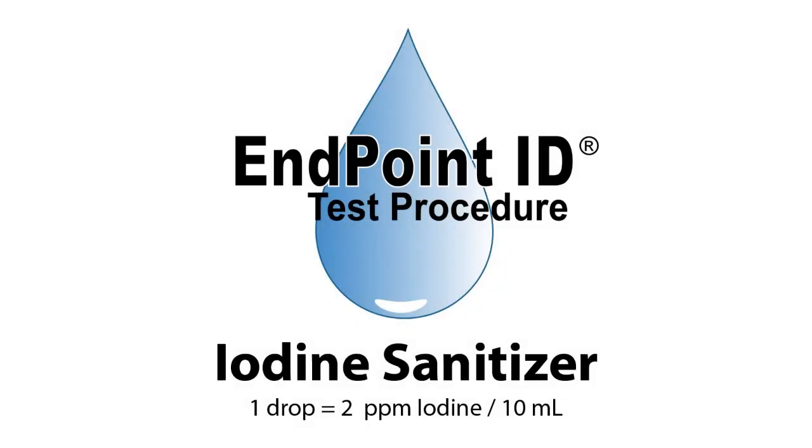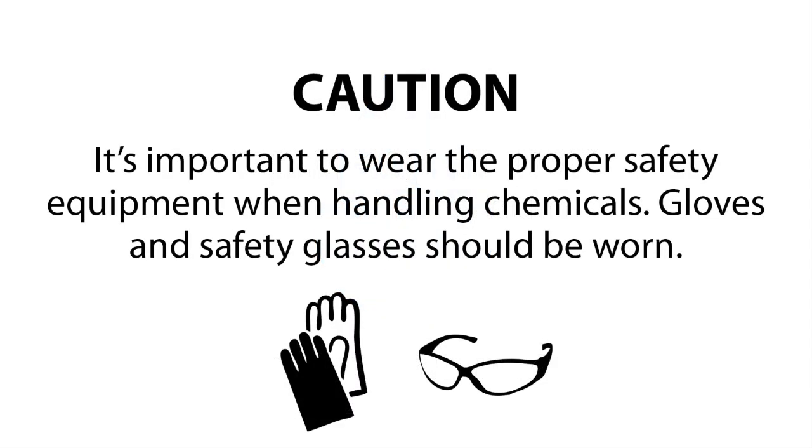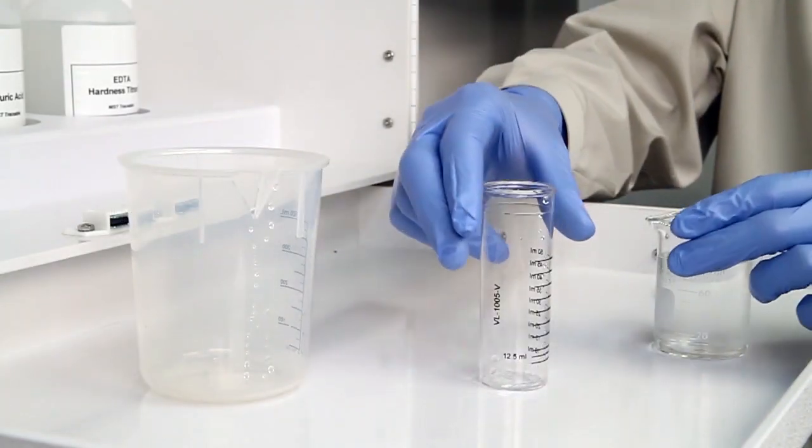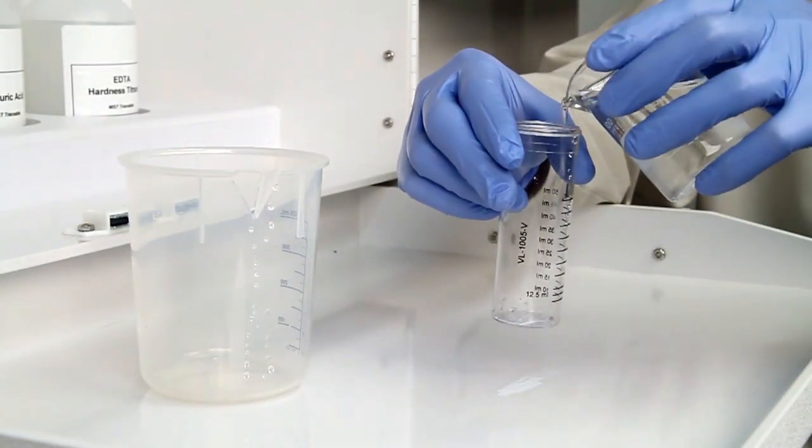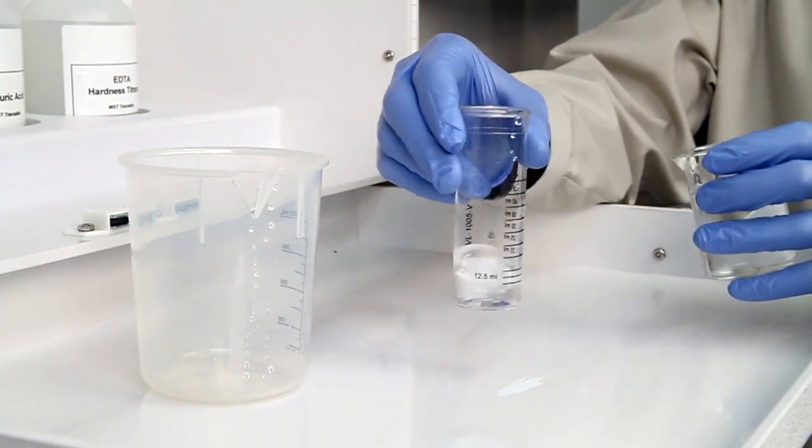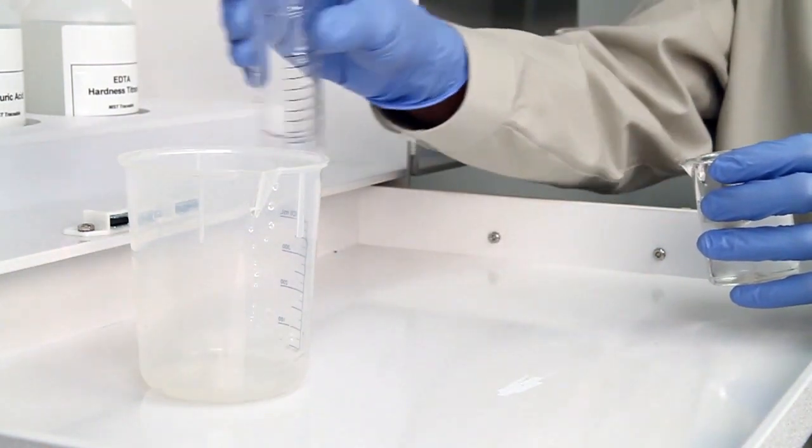This is a demonstration of the Iodine Sanitizer Drop Count Test Kit using Endpoint ID procedures. The first step according to the Endpoint ID procedure is to collect an accurate sample. The smallest change in sample size will lead to inaccurate results.